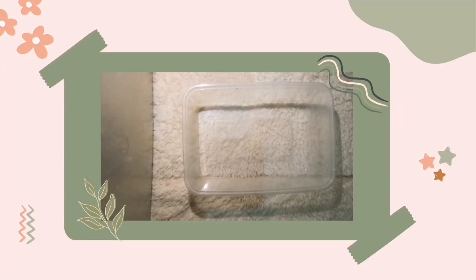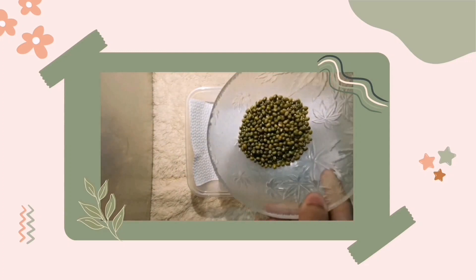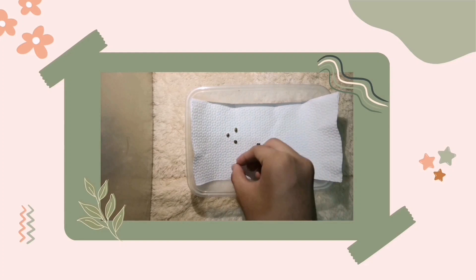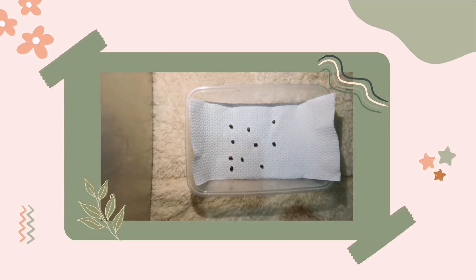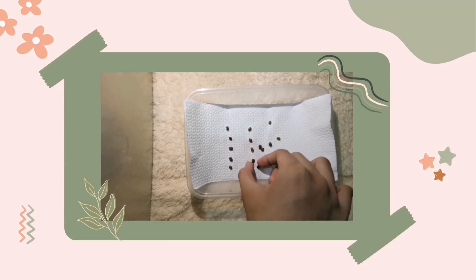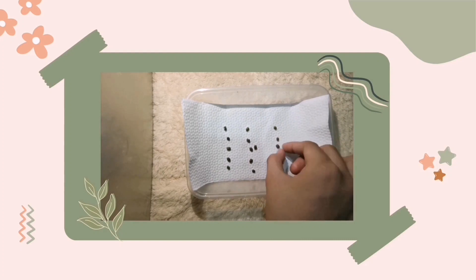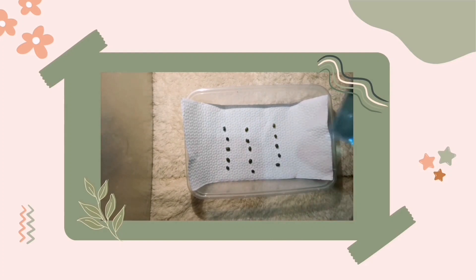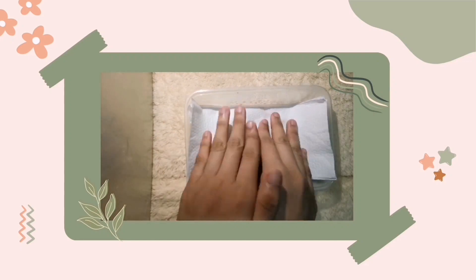So first, get the container and put tissue paper on it. After putting the tissue paper on it, put the seed. And spray it with water. It's better if you have a sprayer so you can estimate the water you put in so you don't overwater it. And put another tissue paper on it.